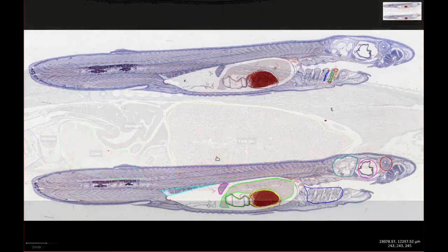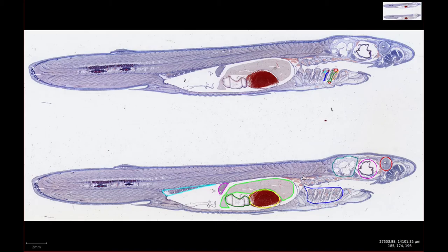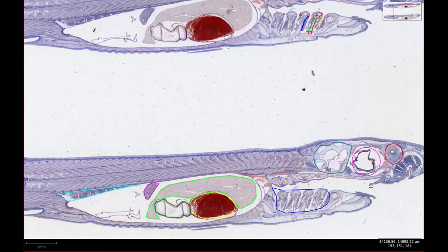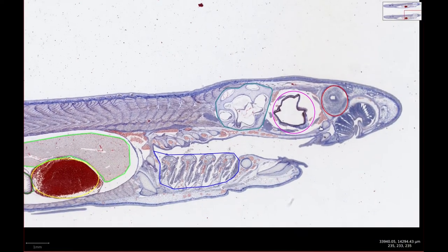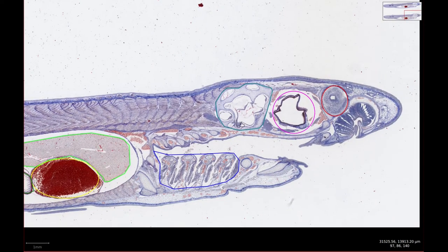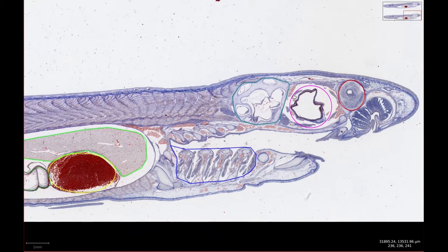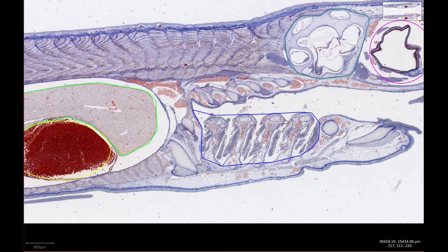More laterally placed is the section on slide 237. Again we have a nice section of the head with eye and the skull cavities behind. The circular structure in front of the eye is the olfactory bulb, which as you would expect given their reputation, is exceptionally well developed in sharks. It was probably present on 244, but the nose was cut off on the scanned version of the slide. In this slide we have a much larger section of the gills again, and very little cardiac cavity.